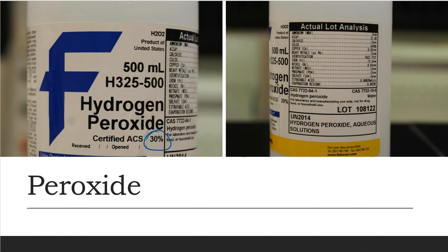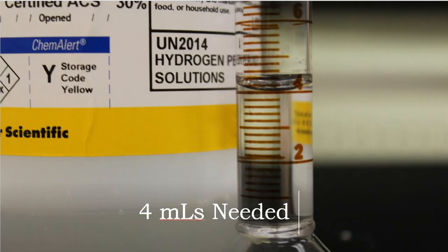All right, so here's the peroxide. Fisher Scientific is the company, Fisher Scientific. And then the lot number is also over here to the right-hand side for you. I think that you can see that pretty well. The lab directions are going to tell me I need 4 milliliters of hydrogen peroxide. So here we go. There's my graduated cylinder. 4 mLs, give or take. Again, this is not quantitative work, so I can use graduated cylinders and just kind of eyeball things and it will be okay.